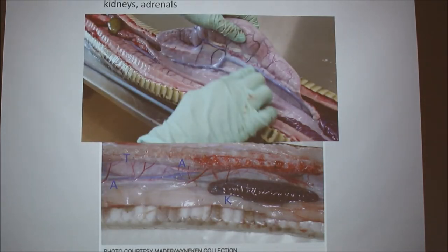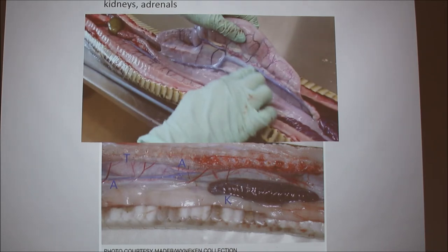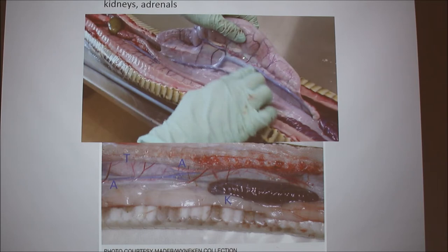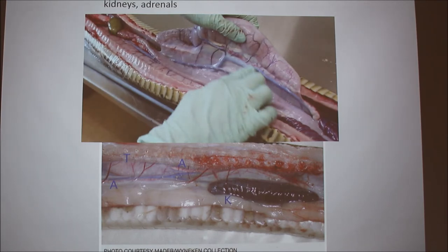Next we have the fourth quarter, which consists of the colon, the kidneys, the cloaca, and the gonads. The adrenal glands are pretty hard to see because you lift up the kidneys and they're located right underneath this little pink slit — that's where the adrenal glands are, and they're beside both kidneys. The gallbladder is usually a nice landmark, a nice little reference point, and you can determine from there.